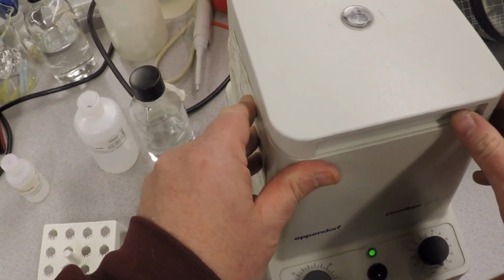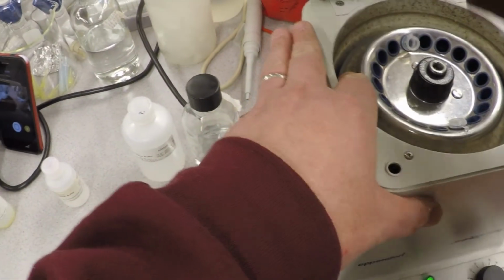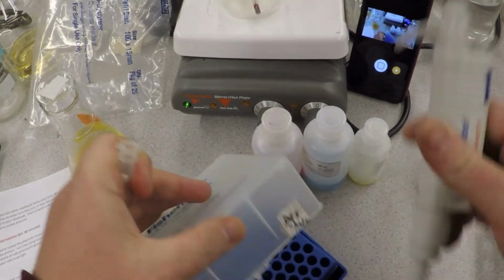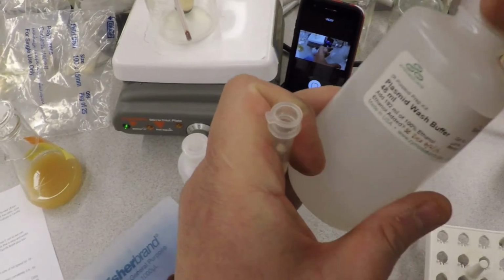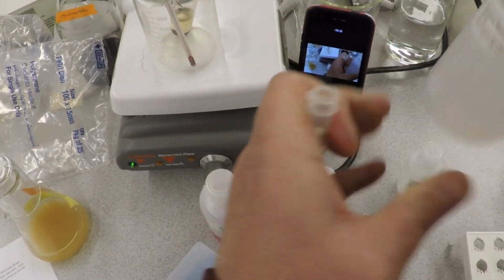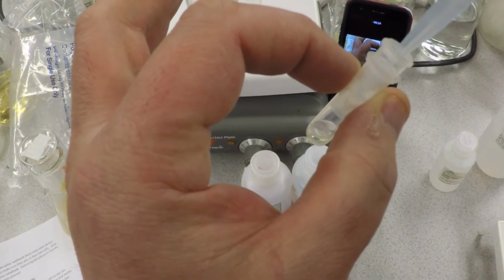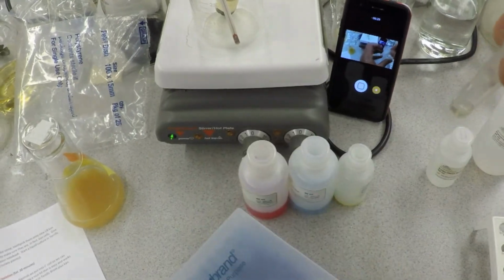This is harder to do and show you guys how to do it than it is for you to do it. It's very simple. Nobody will mess up, okay? So now it says 400 of plasmid wash buffer. Take our plasmid wash buffer. I'll have all these out in Eppendorf tubes so that it's easier to do. So it says add it, just like we did before. Okay. But now it says spin it for a full minute.